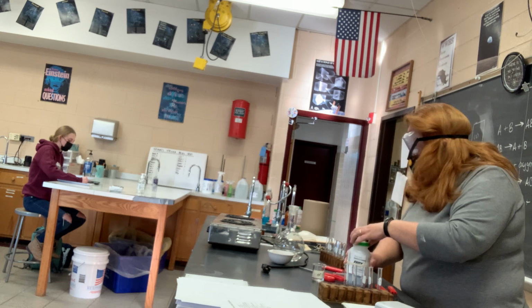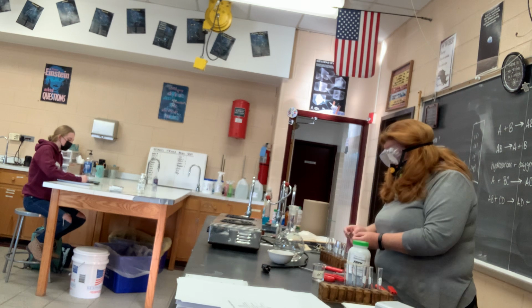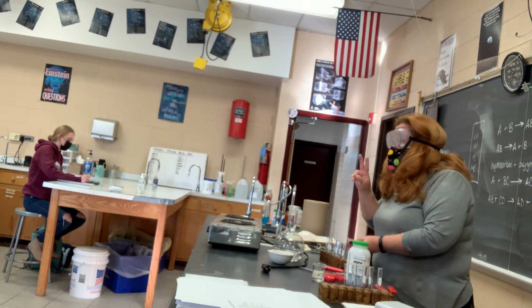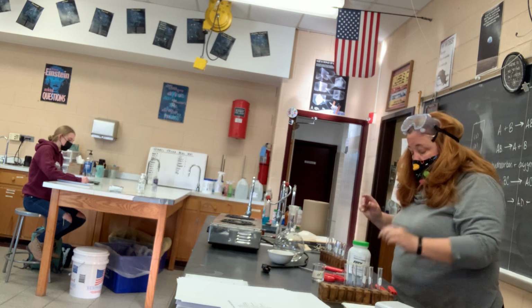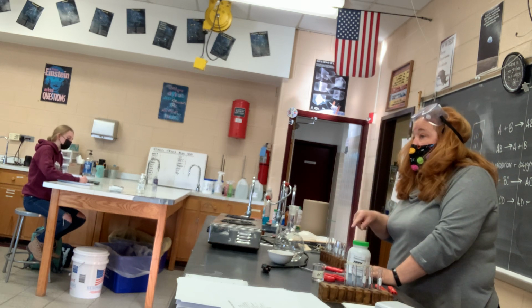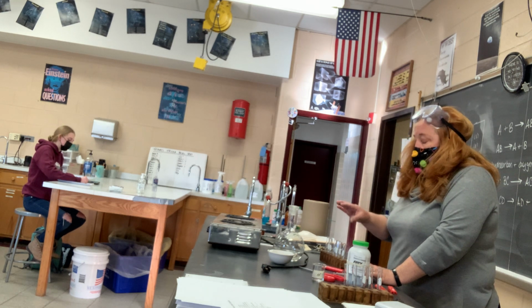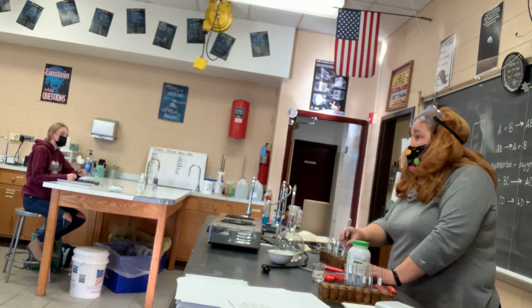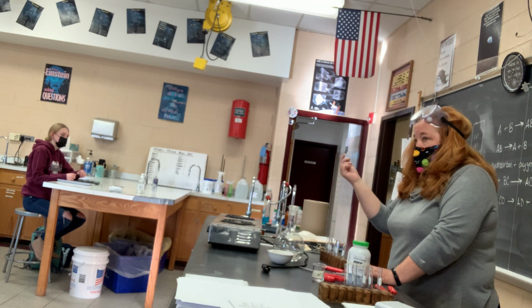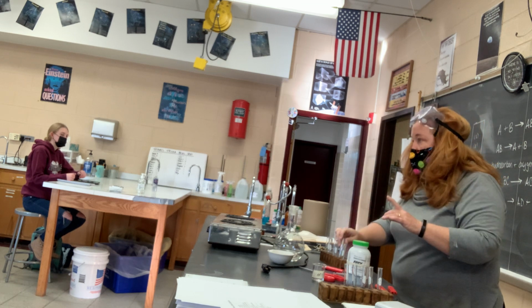And so I know I have to do this really quickly. There are actually 2 reactions going to happen here. I'm just going to preface this by saying this is what's going to happen. I'm going to take the zinc and drop it into the hydrochloric acid, and that's a reaction. At the same time, I'm going to take a second test tube, invert it and capture what the reaction is making, and then I'm going to light on fire what I just trapped inside. So it's really two reactions happening, and I can do it twice if we need to.